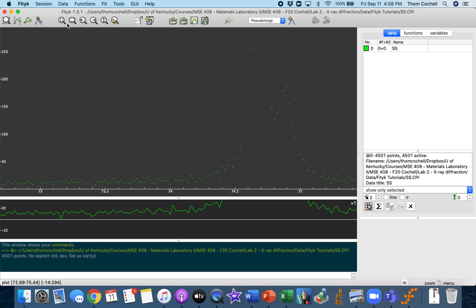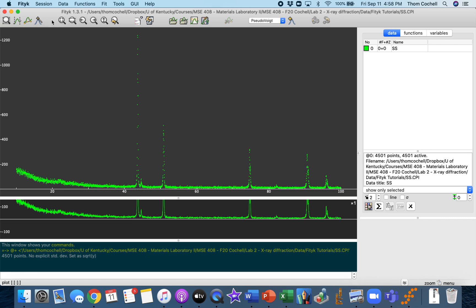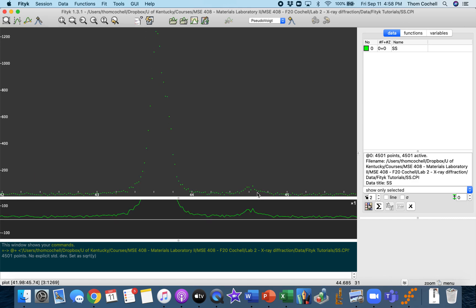That's why I really like software like this — it just allows you to zoom and look around the sample very easily. So the first thing you can do with the software is use the zoom features, move around, and see what you're actually looking at with these various peaks. Because you're collecting a lot of data points within one degree, and you want to be able to see that. Really use these zoom features so you can truly see what's going on and look at these different features — that's the first thing you want to do.